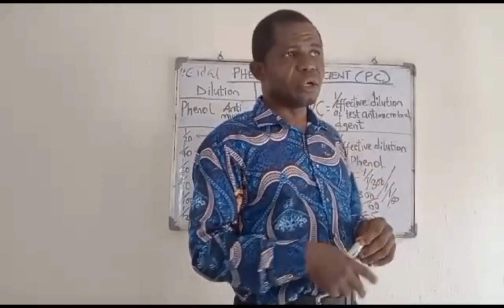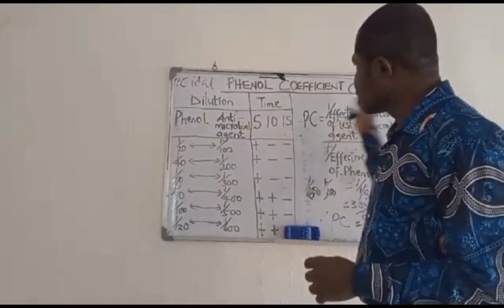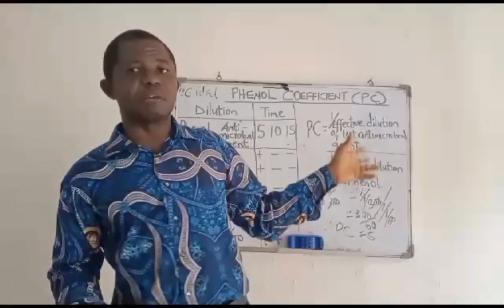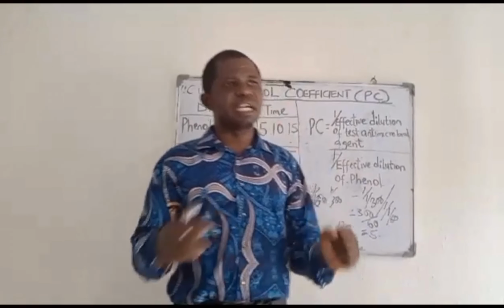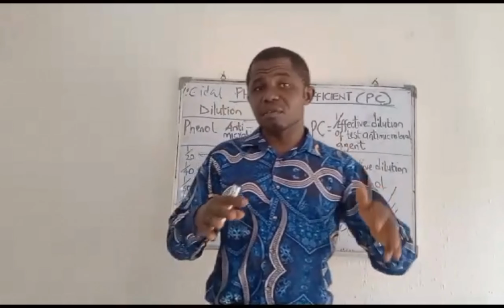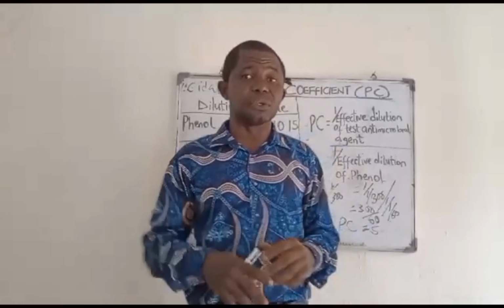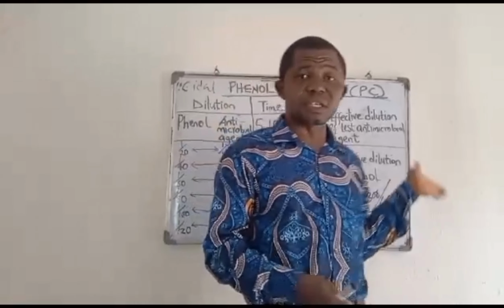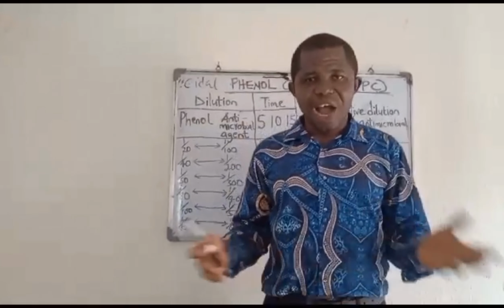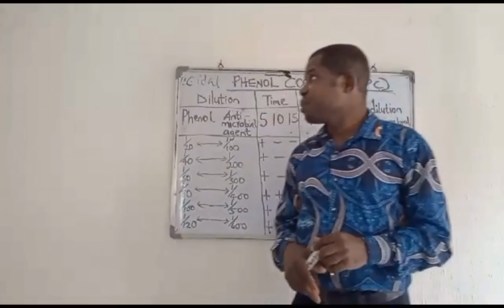So we want to say here that phenol coefficient is important because we determine the potency of a bactericidal agent in comparison with phenol against a specific microorganism or set of microorganisms within 10 minutes.